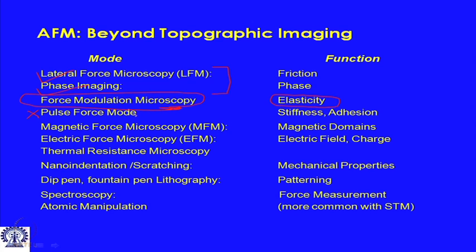So, anyone who is interested can sort of figure out what this is. Then I'll try to give you some glimpse about the magnetic force microscope and the electrical force microscopy. Both of them have very similar operating principles. They involve a contact mode scan as well as a non-contact mode scan, and then one has to do some clever subtraction of the scans you get to identify the different domains. They rely on the fact that different forces in proximity to the surface have different scaling properties, and therefore, they are different. So, we will see how it looks.